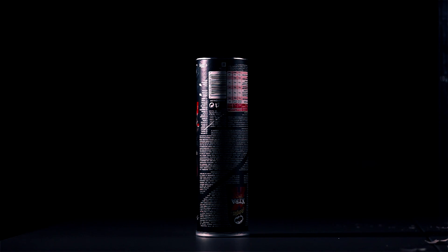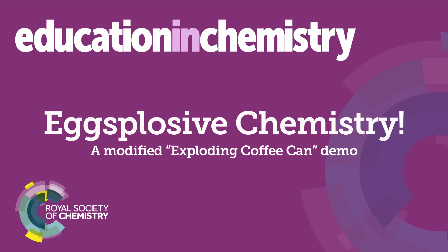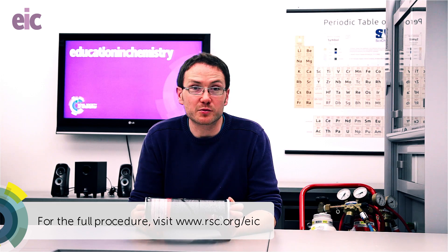FuelMX can provide some great stimulus for balancing equations, so this month we're going to be having some fun exploding some food cans and some eggs. We've exploded some food cans on Exhibition Chemistry in the past, but today we're going to be revisiting an absolute classic demonstration that should be in the repertoire of any chemistry teacher worth their salt. It's often known as the exploding coffee can, but today we're going to be using a Pringles can.